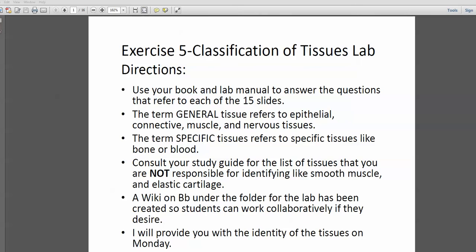With this video, I am going to very quickly identify the tissues that I provided to you as a way of studying the content of the classification of tissues lab. What's really important when you're studying the tissues is how you go about identifying the tissues. So I wanted to actually sort of run through that process versus just simply giving you the answers. So I'm going to identify the various tissues.